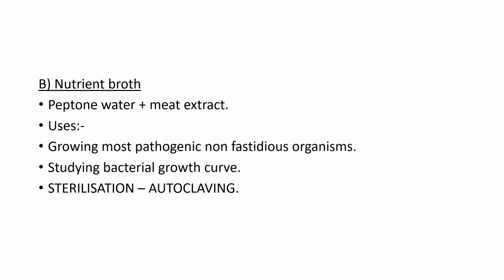Now the nutrient broth, which I have already discussed previously. It consists of peptone water and meat extract, and its uses are growing most of the pathogenic non-fastidious organisms and studying the bacterial growth curve. Its sterilization is done with autoclaving.